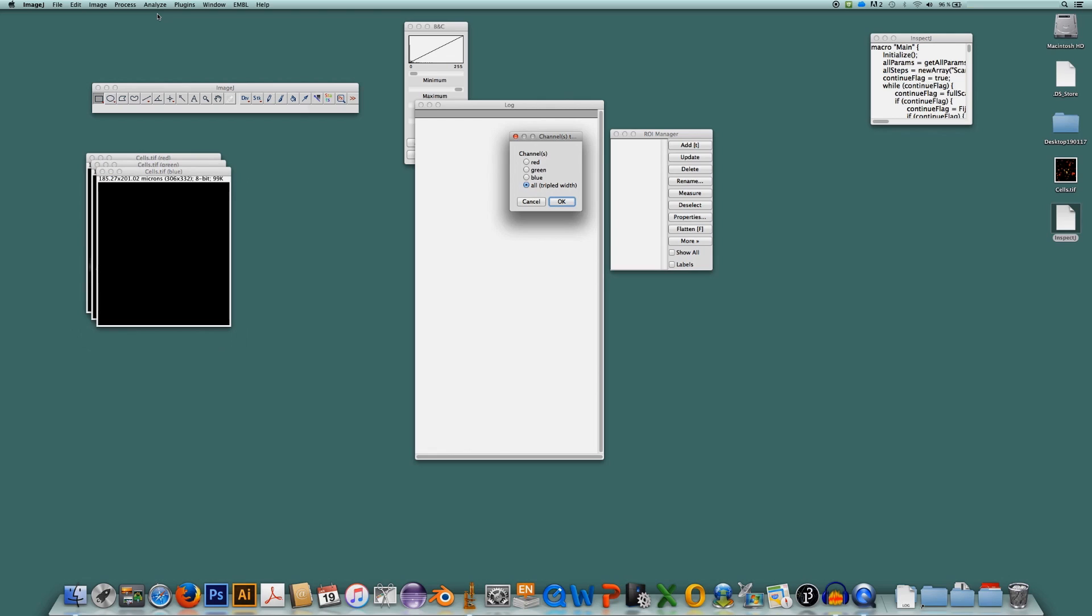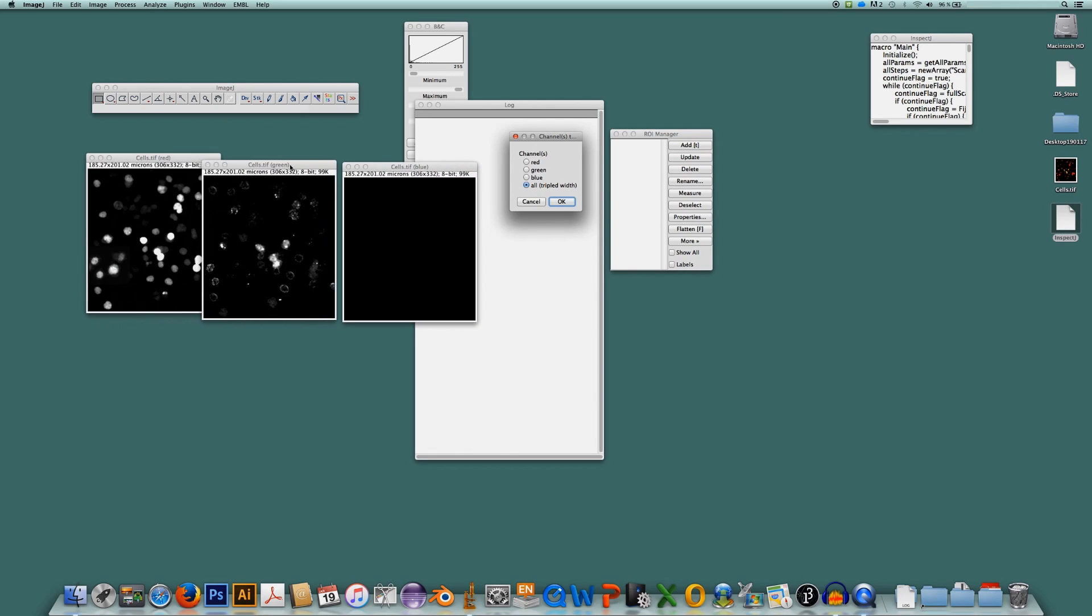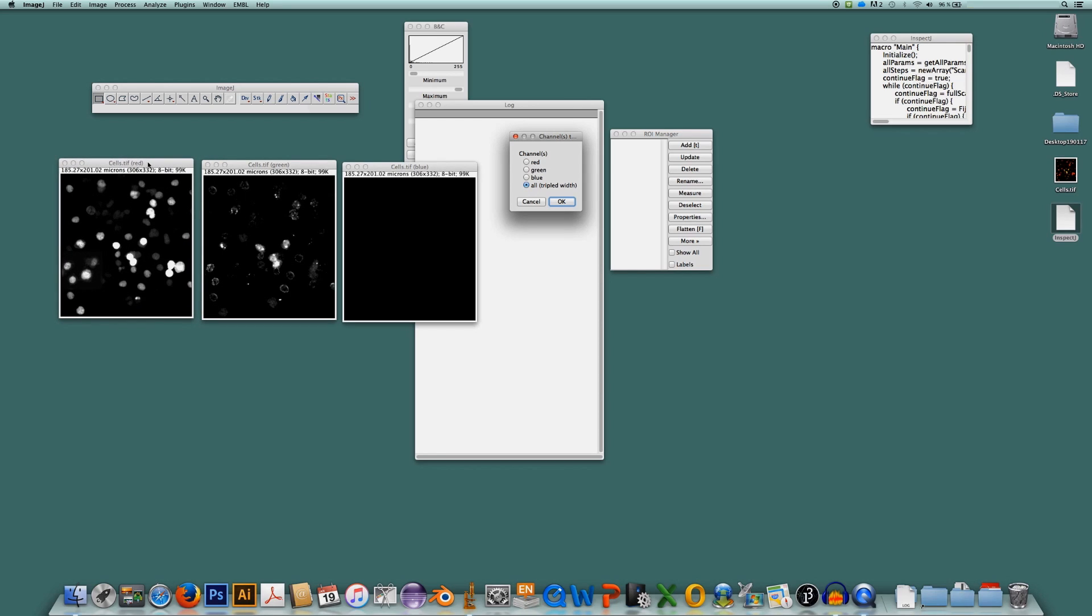The first thing InspectJ will do is it will separate the three channels, the red, green and blue channel of the image. So now we have an individual red, an individual green and the blue channel.